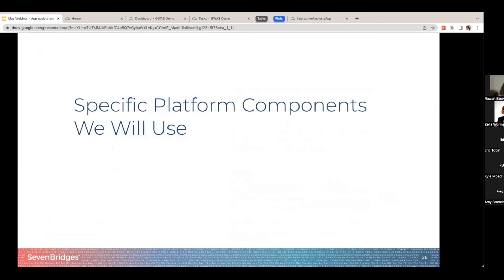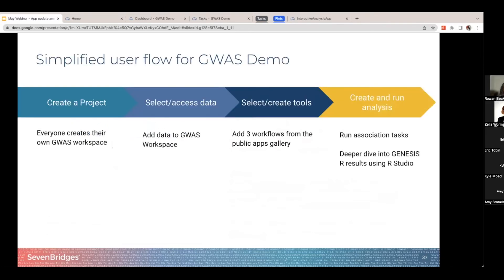There are some specific platform components we're going to be using today. First, here's the user flow for a GWAS demo. Basically you create a project — your own GWAS workspace — and I'll show you how to do that. You add data to this workspace, you add the three workflows from the public apps gallery, and then lastly you run an association task. If we have time, we can dive into the results using RStudio or any kind of data cruncher.